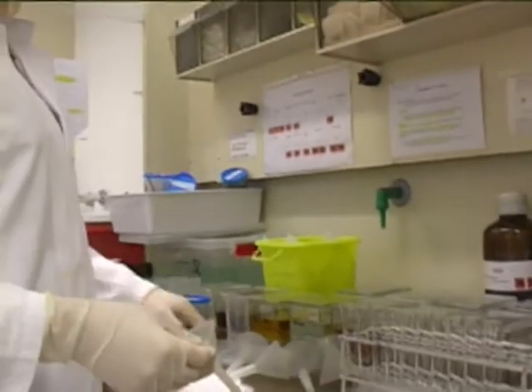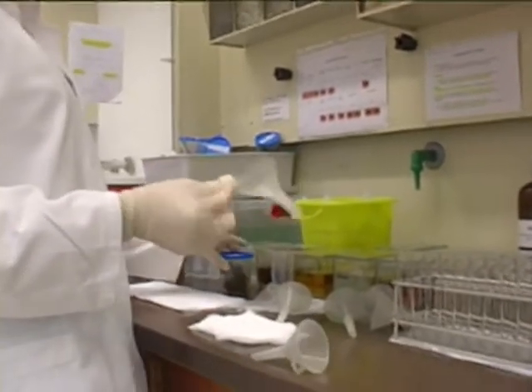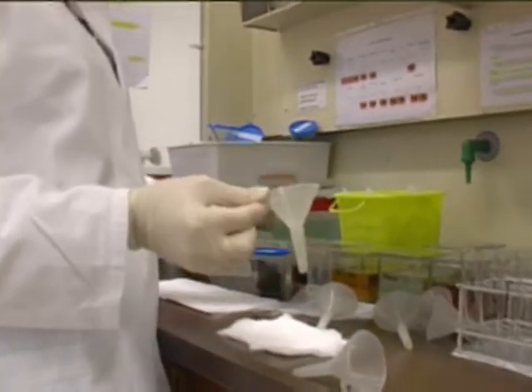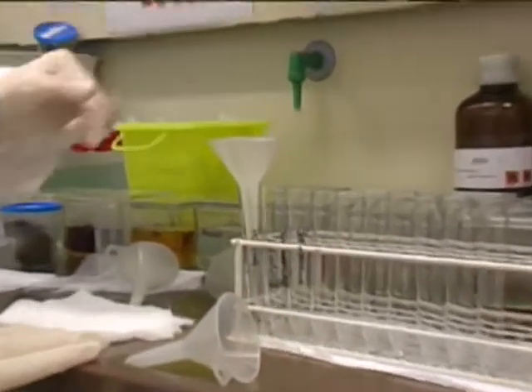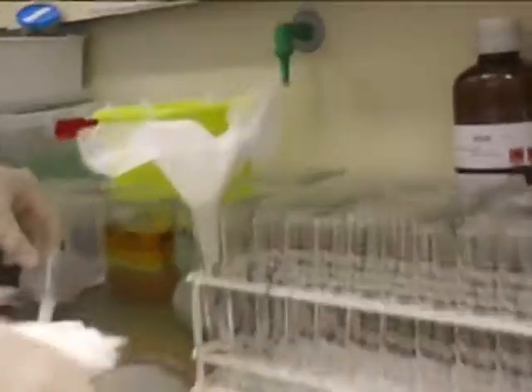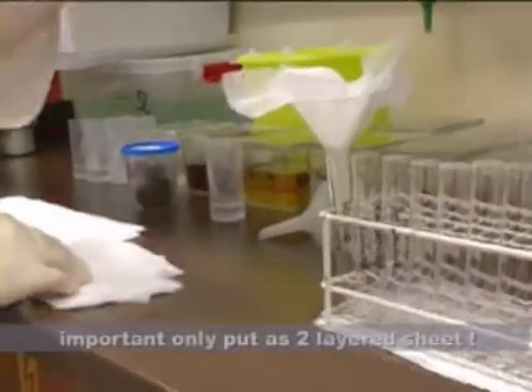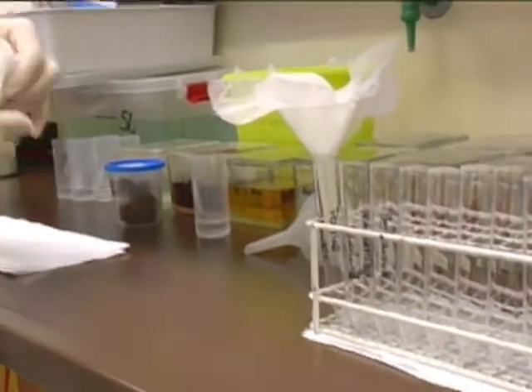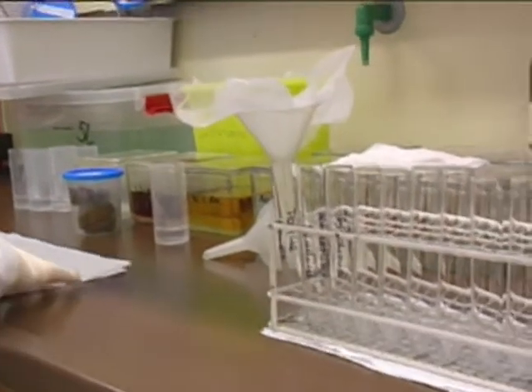Funnel. For each stool, one funnel. You put it in the glass tube, just like this. Wichtig ist wirklich nur zweilagig, also nicht dicker. Only two layers, not more. Okay, gut.